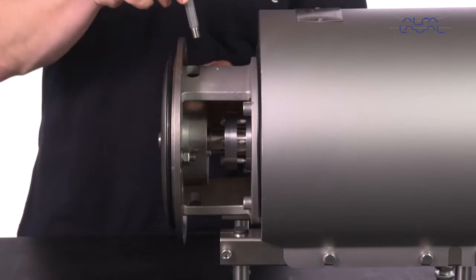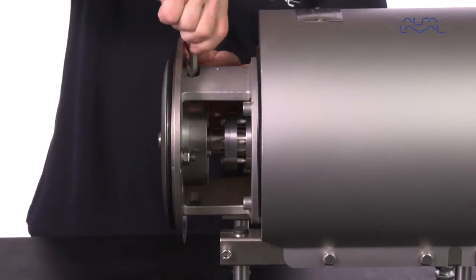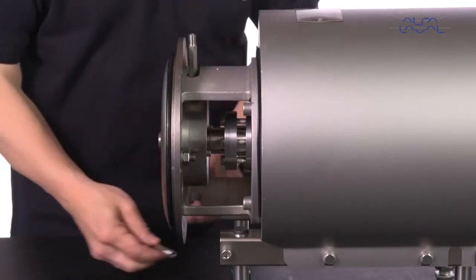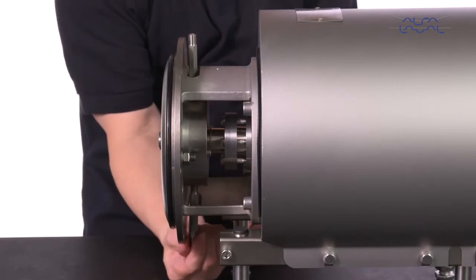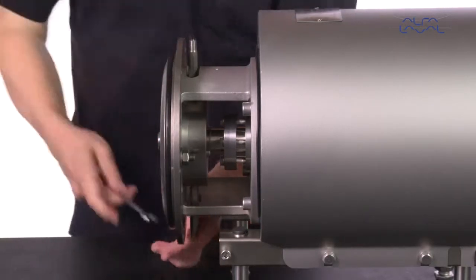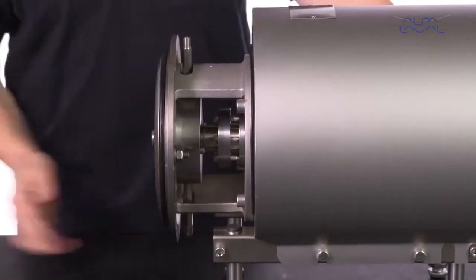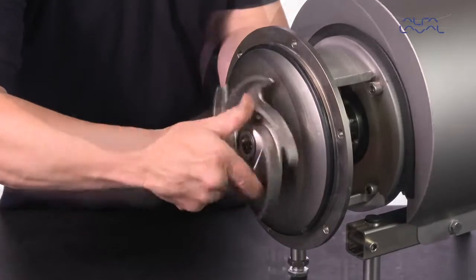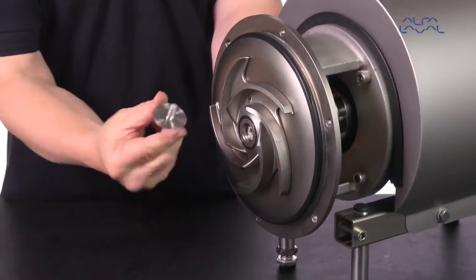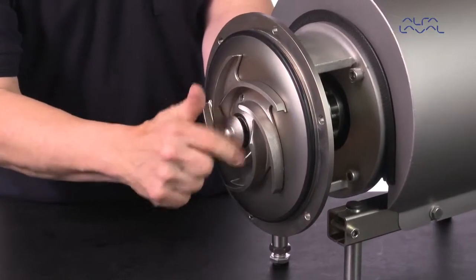Fit the flush connection pipes. Lubricate the impeller hub with silicon grease or oil and screw the impeller onto the stub shaft. Fit the impeller screw and tighten it.